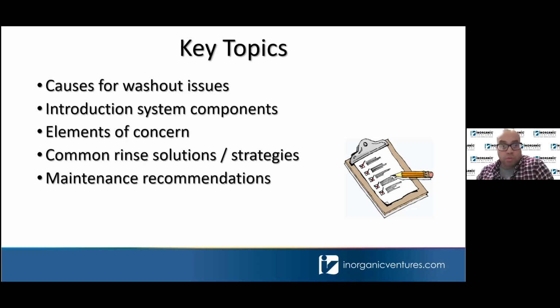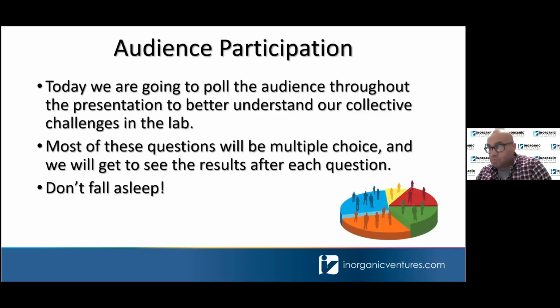Once we get through the elements of concern, we'll kick it off to Thomas and transition to him, and he'll start talking about some strategies to mitigate or eliminate memory effects associated with washout problems, and he'll also be providing maintenance recommendations. All right. So we truly want this to be more of an interactive discussion rather than just a straightforward PowerPoint presentation. With that, we'll be polling the audience throughout just to get a sense of what kind of instrumentation, what kind of challenges you all are experiencing in your labs as we go throughout.